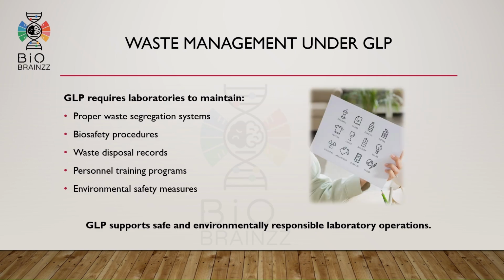Under good laboratory practice, laboratories must maintain proper waste segregation systems, biosafety procedures, disposal records, personnel training programs, and environmental safety measures. GLP supports safe, standardized, and environmentally responsible laboratory operations.